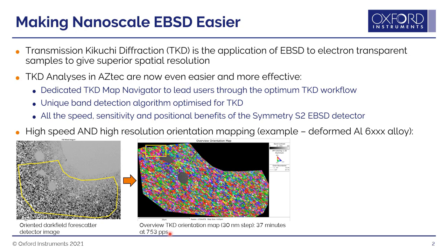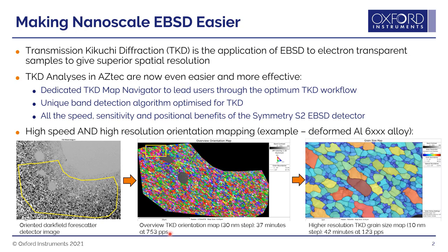We then identify a region to analyze in more detail. Here we see a high resolution analysis — the scale bar is 2 microns, with a step size of 10 nanometers. This is measured at a slower speed to get higher precision data at about 123 patterns per second.